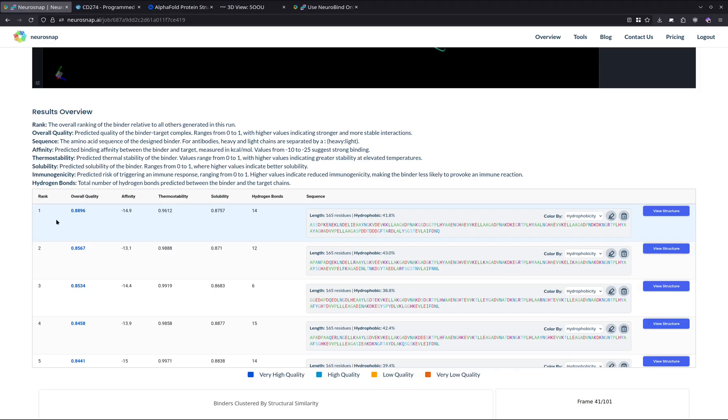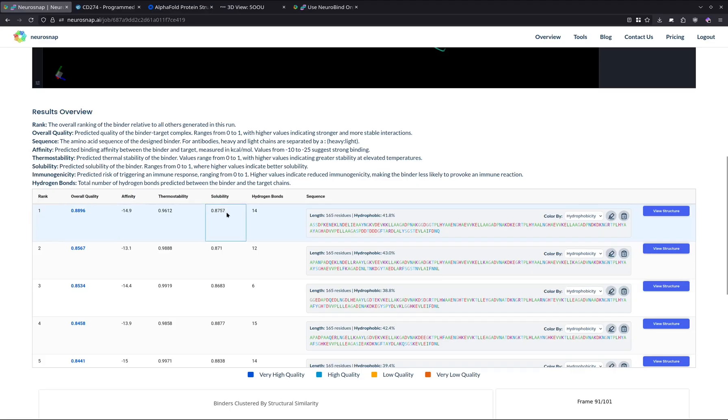The next one is going to be affinity. This is a predicted affinity value in kilocals per mole. And next up is thermostability and solubility, which are predicted between 0 and 1, where higher is generally more favorable.